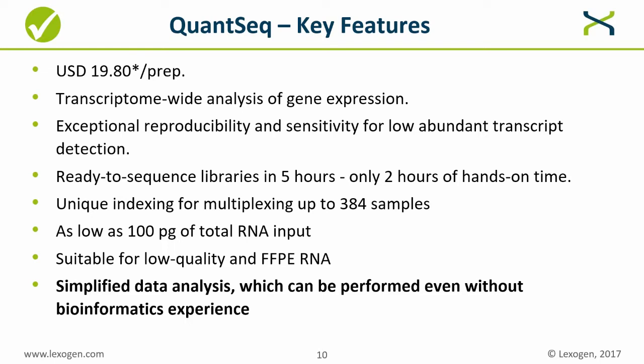What I didn't yet mention is that this protocol is able to incorporate low amounts of total RNA, as low as 100 picograms, and the protocol is also highly suitable for low quality and FFPE RNA samples. As a final point here, and because today we're talking about data analysis, because QuantSeq generates just 1 3' tag per transcript, this greatly simplifies the data analysis process, which allows researchers to analyze their own RNA-Seq data, even if they haven't got any significant bioinformatics experience.